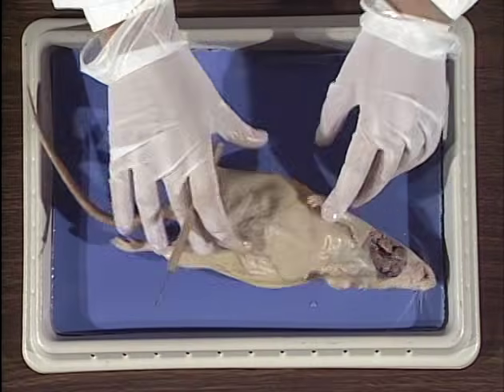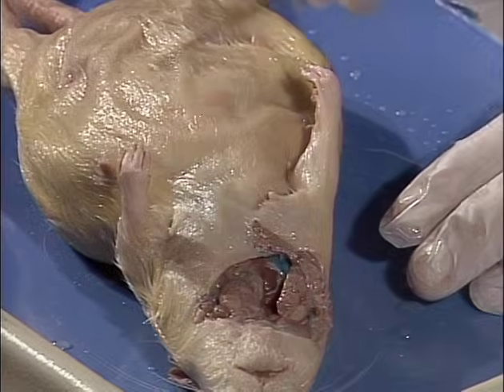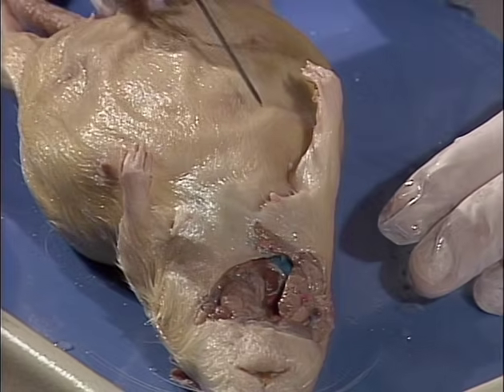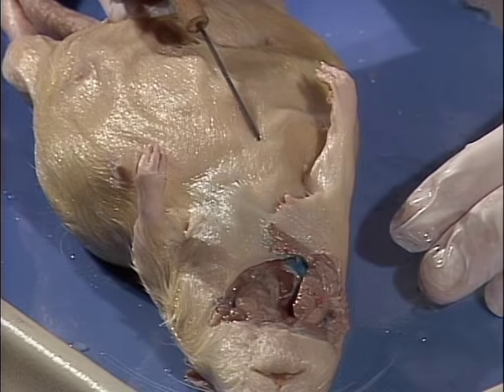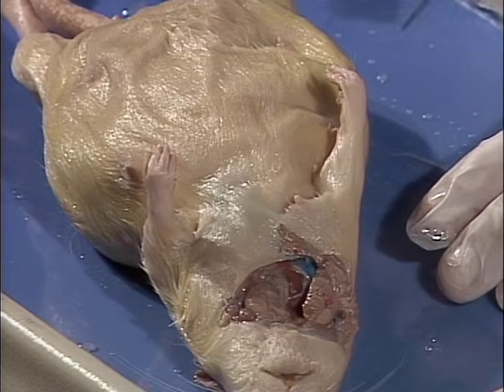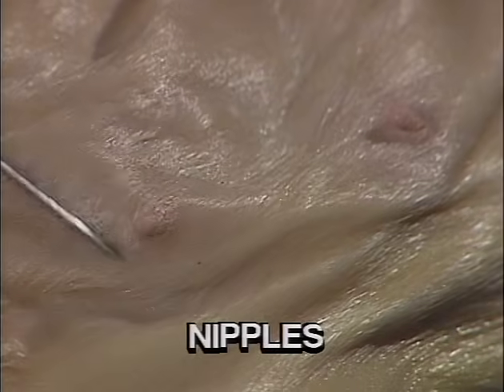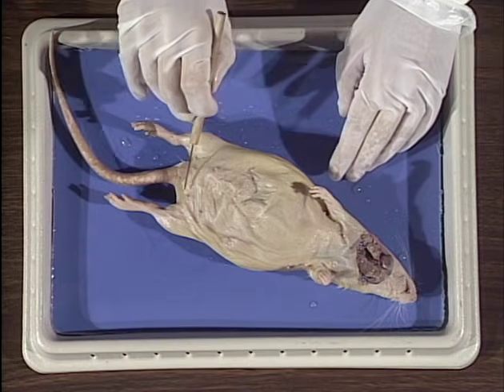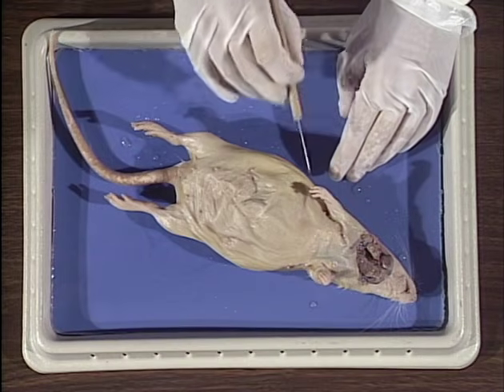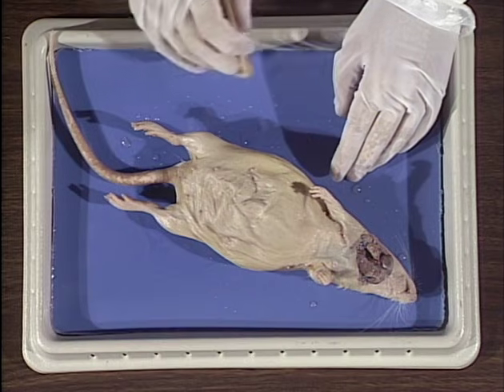The trunk of the rat is divided into a thorax and an abdomen. Internally, it is divided by a sheet of muscular tissue known as the diaphragm. On the ventral surface of the rat, we can see a row of nipples, which are the external openings to the mammary glands. There are 12 nipples found on the body of the rat. The number varies from mammal to mammal.